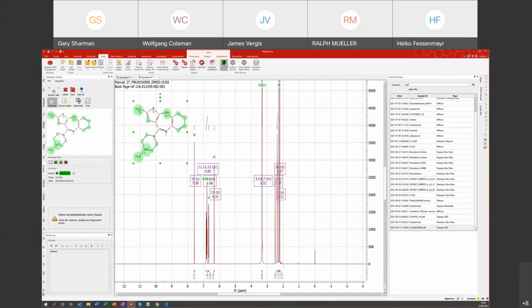So that's just as simple as going to this kind of custom button and hitting to write it back into the system. It asks me for a name for this sample to go in there, and that will send it back into the ZONTAL space system. There we go, the upload is complete, and probably in a few seconds time we will see that package has got back into the system, and again will have been stored within the ADF file back within ZONTAL space.